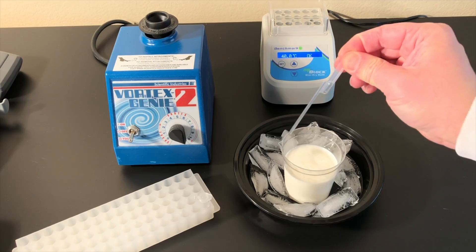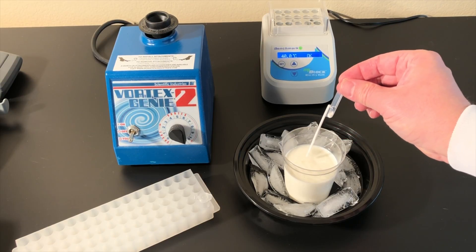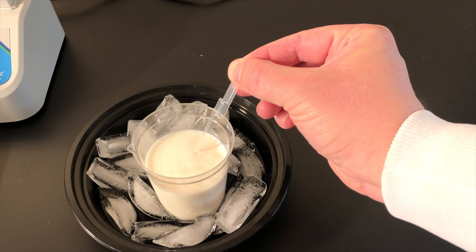Use refrigerated raw or whole milk sample. Keep sample in the refrigerator or on ice before use. Pipet 200 microliters of sample with a disposable pipetter. The lower bulb will partially fill with sample.